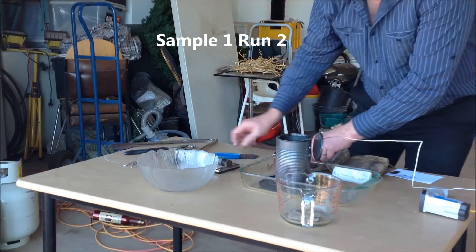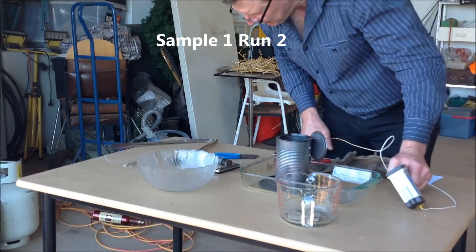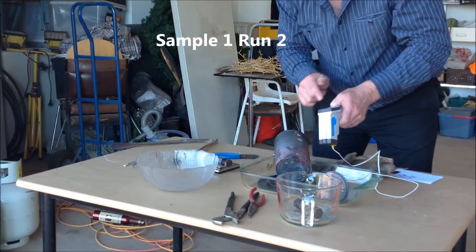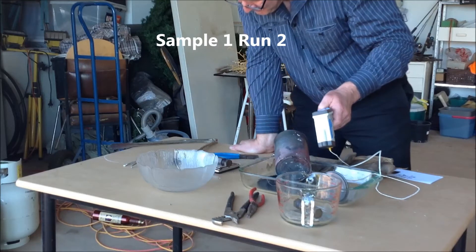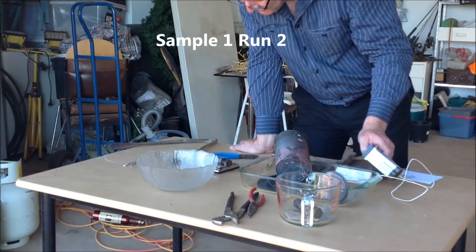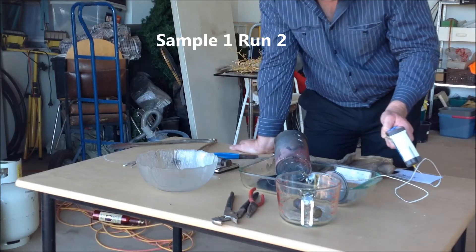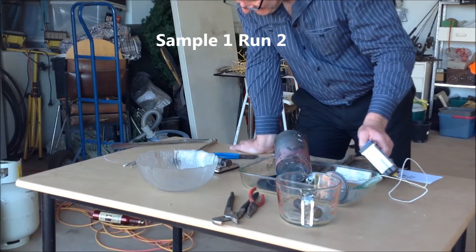267.57. 516.2, 267.55. 460, 267.53. 440, 267.47. 430, 267.43. 420, 267.33.